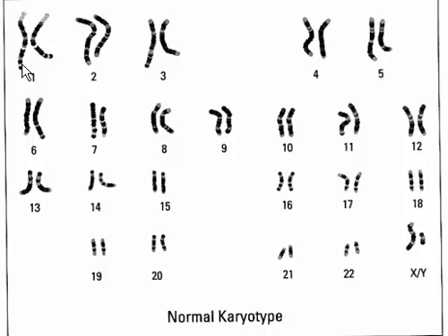The individual doing the karyotype analysis takes the picture, and then they have to digitally move the chromosomes to where they identify the homologs. So you can see that chromosomes 1 and chromosomes 2 are fairly similar in size, but their banding patterns produced are very different. So these banding patterns, again produced by staining, help to identify the homologous pairs.